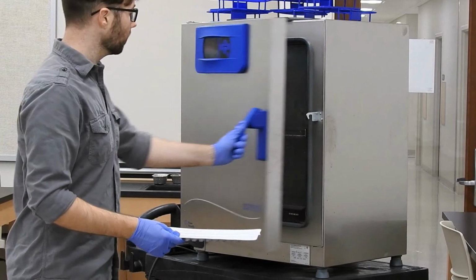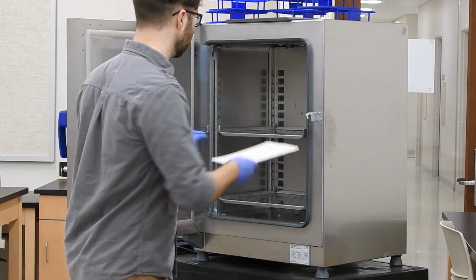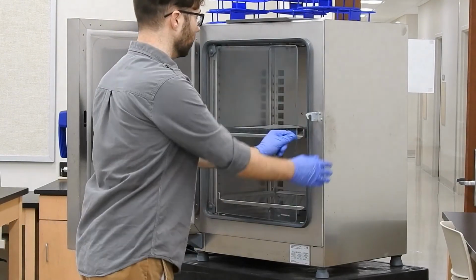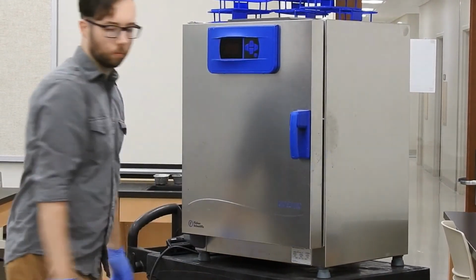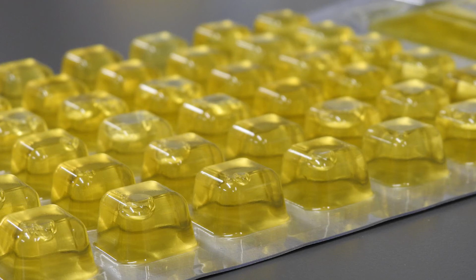Here's the incubating oven that we use for Stream Team. After you've written the time on the sample, you put it into the oven, and it will incubate for 24 hours. After that time's up, we will take all the trays out and we'll start to count them.